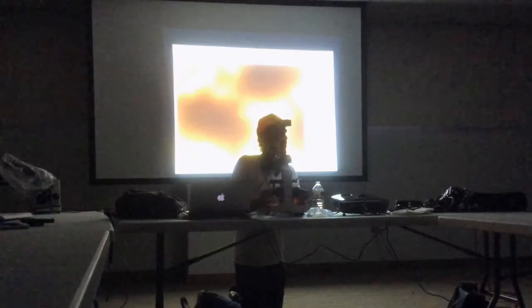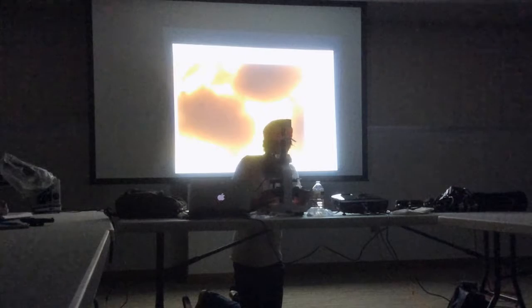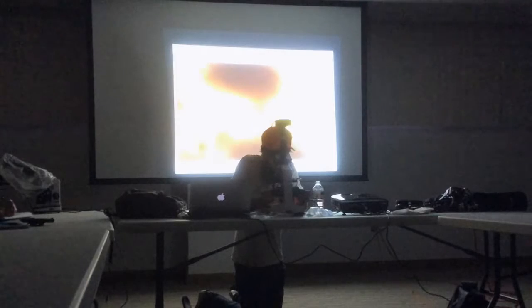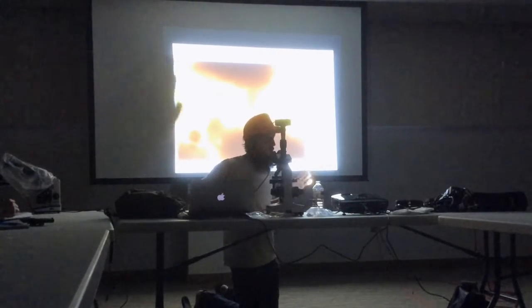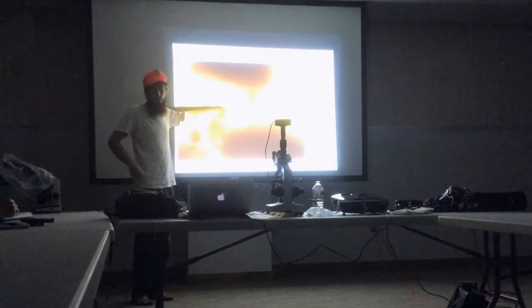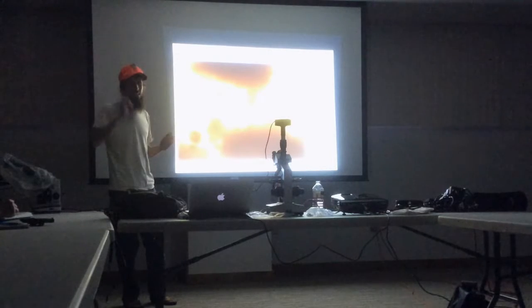So what I try to do is scroll to some random spot and look to see what I'm working with here. You guys can't see it, I have a little bit wider field of vision here, but this guy was in my field of vision. So I scrolled to some random spot on my slide, a random view is what this is called, and in this view, I found another fungus. So I know that I'm getting closer to that equal ratio, because everywhere I go, I should find at least one.